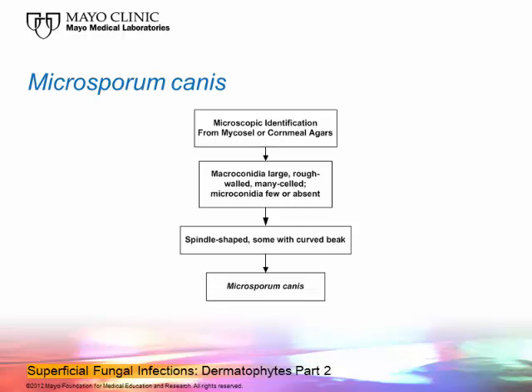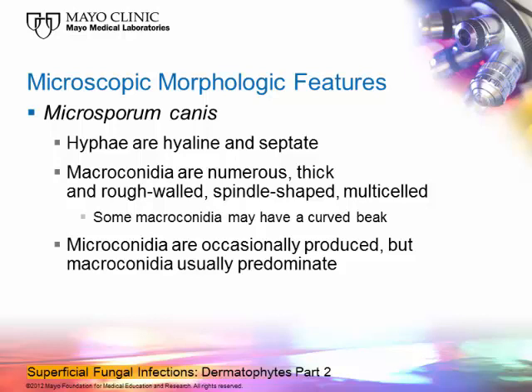The macroconidia of Microsporum canis are spindle-shaped. If you look at the distal tip — the tip where they're not attached — you'll notice that it actually curves. Sometimes you'll see some rough projections on that part. It has a curved beak, and that is what we use for recognizing Microsporum canis. This is one of the easiest ones to recognize. The hyphae are hyaline and septate, and the macroconidia are rough-walled, spindle-shaped, multicellular, with a curved beak.